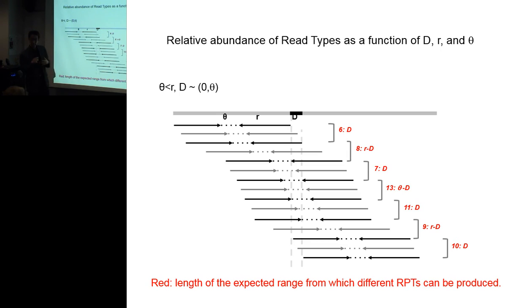But don't different genes sometimes have the same kind of repeats? It can be dinucleotide, trinucleotide, whatever. Wouldn't that complicate life here? It will complicate the inside read. If you have the same trinucleotide repeat, you don't know how to map it. But all of these read types have unique sequences outside to anchor them. So the question about mapping is very important.